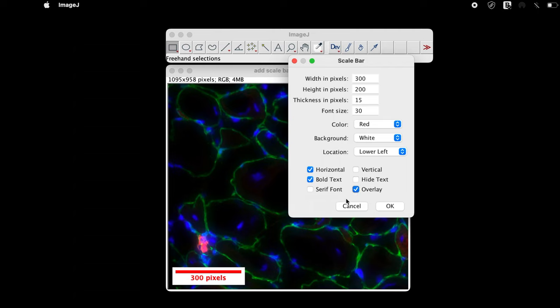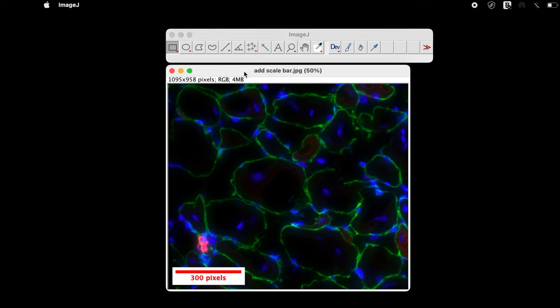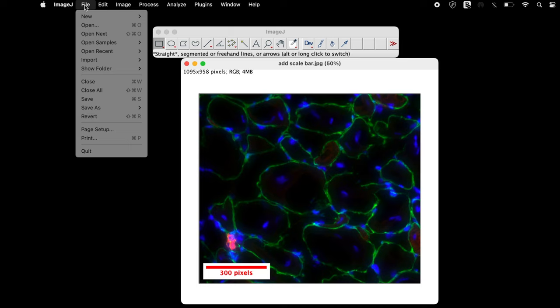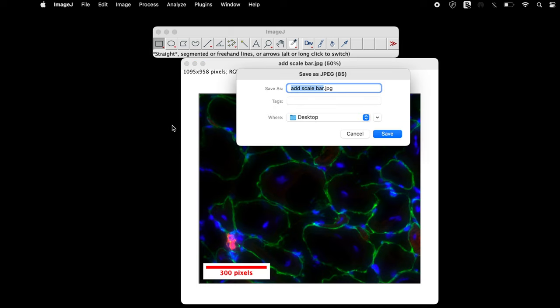Once all the parameters are set, click on OK. This image can also be saved in any format of your choice. To save it in the JPEG format, click on File, Save As, and JPEG. Now the image is saved in a JPEG format with a scale bar added to it.